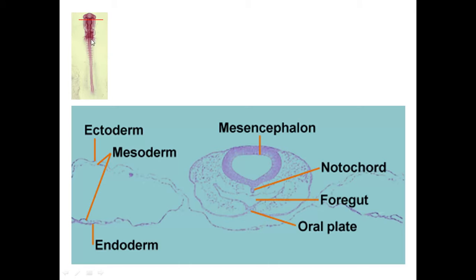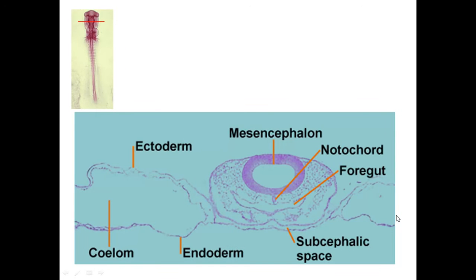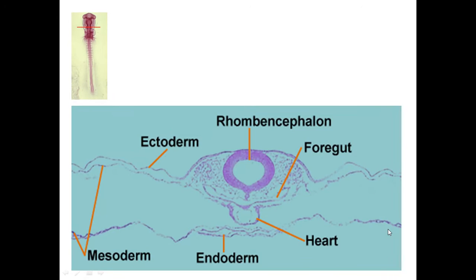So in lower sections, we'll see that. Okay, so we're still seeing the same things. Here, in this part, we can see the continuity of the animal proper with ectodermal and mesodermal, somatic mesodermal tissues that will actually form the coelomic cavity.